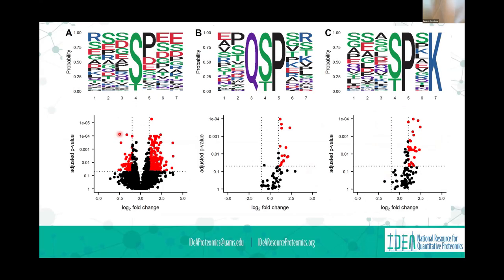We can take peptides and look at a motif. And so this is actually really nice because in an upregulated setting, you can pull out and look at certain motifs, track those back to maybe a kinase of interest, and you're able to kind of take that next step.